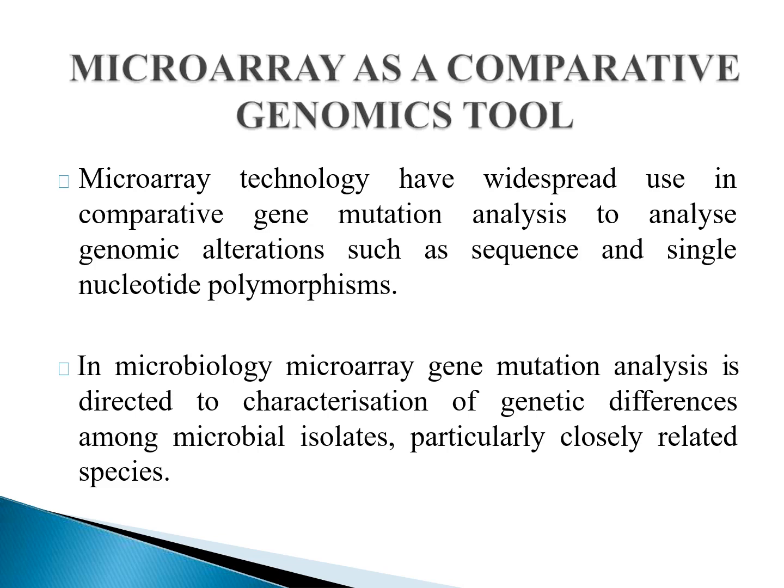And in microbiology, microarray gene mutation analysis is directed to characterization of genetic differences among microbial isolates, particularly closely related species. Many times the morphological characteristics of two different species may be similar, and that is why they are not recognized as two different species. So we can make use of DNA microarray technology for characterization of genetic differences among those isolates, and we can prove them as two different species.